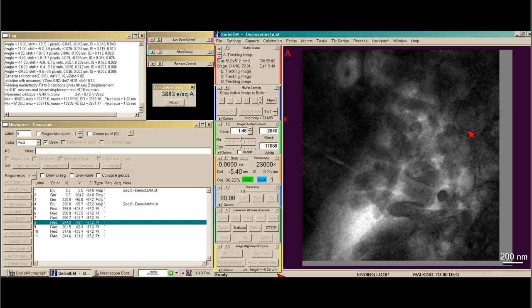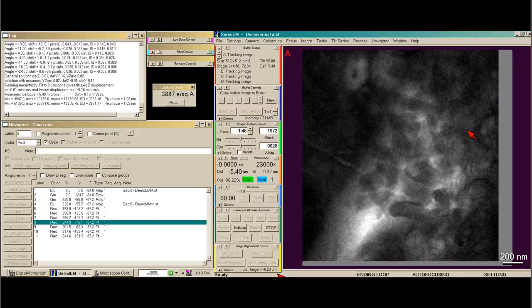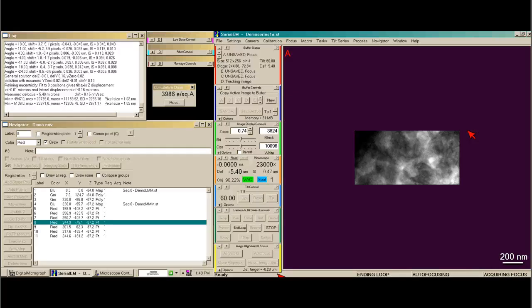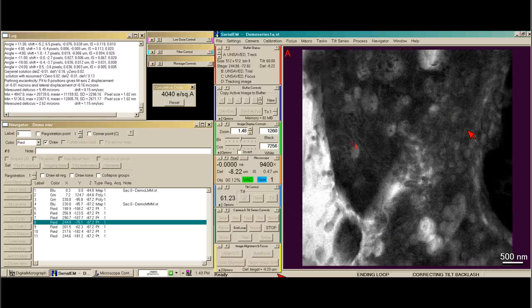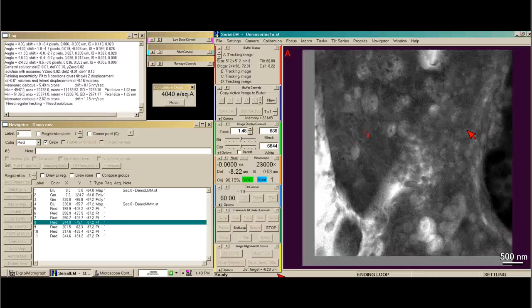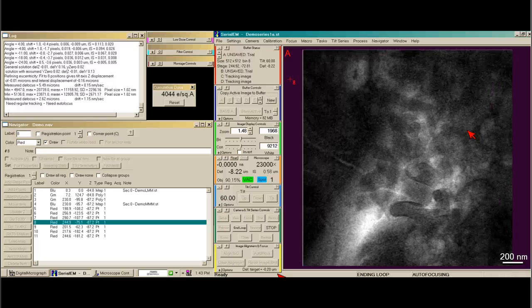We're already at 60 degrees. Now it's going to take its final image, then it's going to focus, get us back to focus, and correct for tilt-backlash, which is just the general backlash of the CompuStage — so it goes up to 63 degrees and comes back to 60. It does this at low mag. And now it's going to recenter, focus, and take our first record.